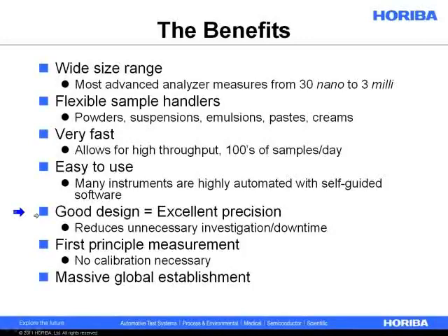If it's not producing the same answer and it's because of the instrument, you're going to be wasting a lot of time investigating: is this really the same material? Are my procedures good enough? Are the operators doing what's correct? All sorts of different things. But if the instrument is really well designed, you can remove that as a possible source of error and really shorten your investigation. I would call it unnecessary investigation.